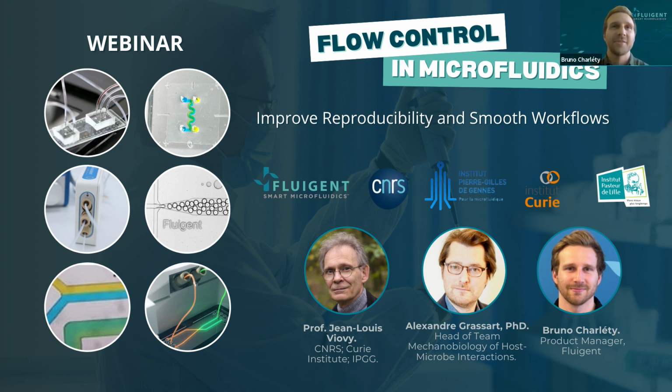I'm the product manager at Fluigent, and I am today with Professor Jean-Louis Viovy, researcher at Curie Institute and co-founder of Fluigent. I am also joined by Dr. Alexandre Grassart, head of the research team of mechanobiology of host microbe interactions at INSERM. And we will be discussing all together flow control in microfluidics.